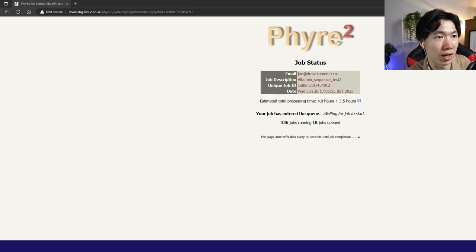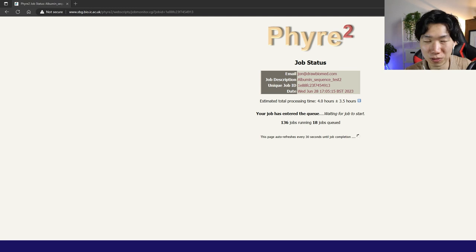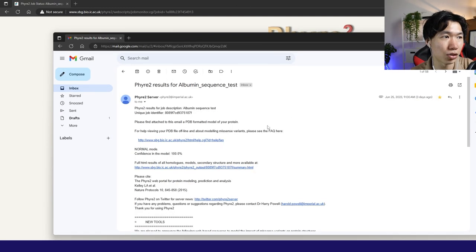This is the job status page. It will take more than 4 hours to find the protein model sequence. After it's finished, they will send you an email like this.